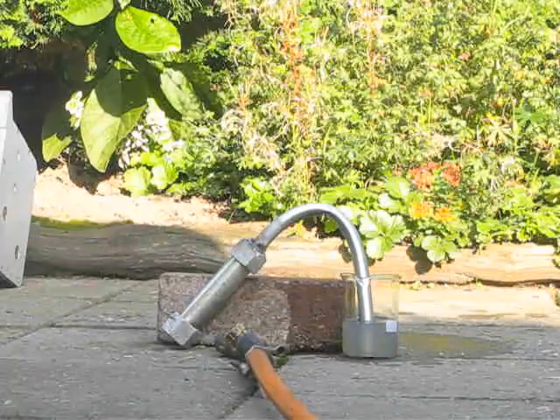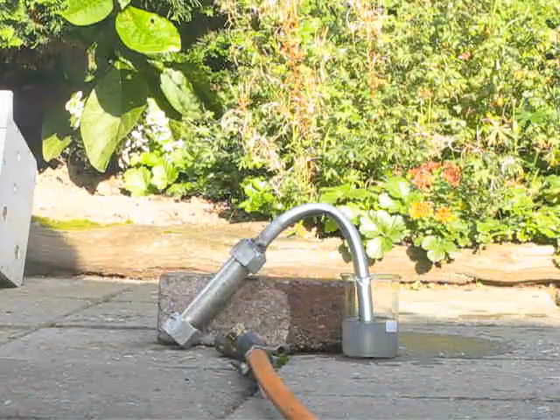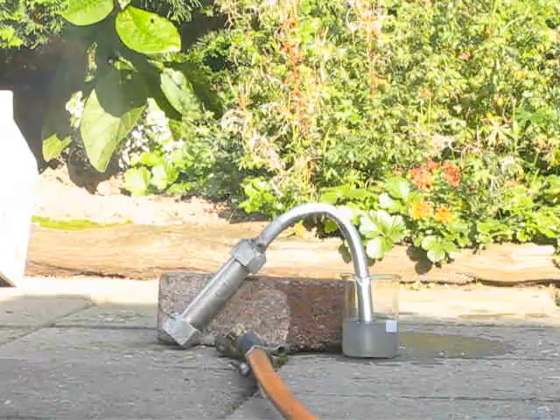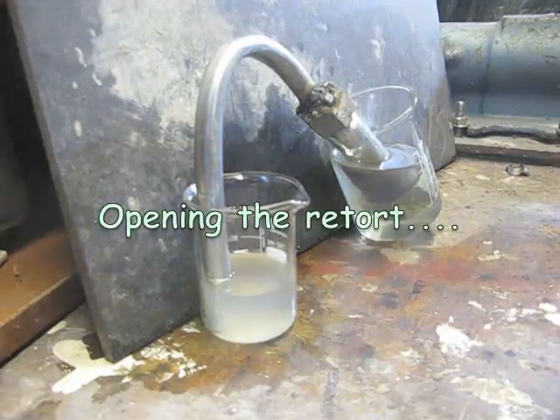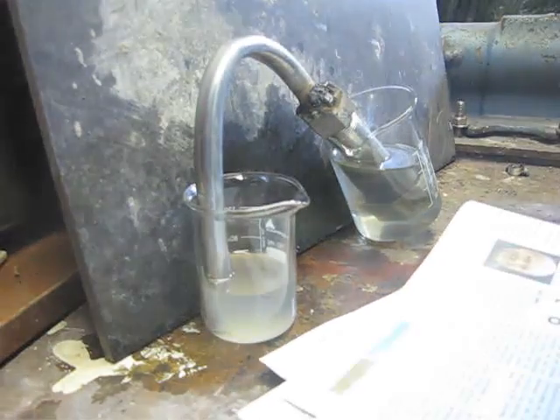Let it cool down. I'm going to try to extract the potassium. Now it's cooled down. As you see here, I've put the retort into some lamp oil to absolutely prevent the incursion of air and moisture.